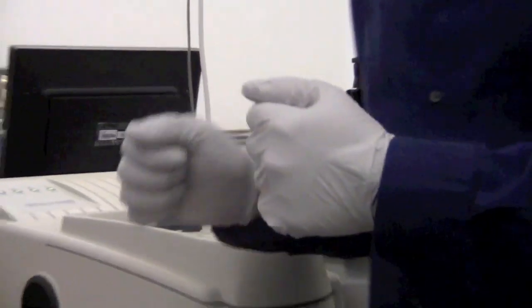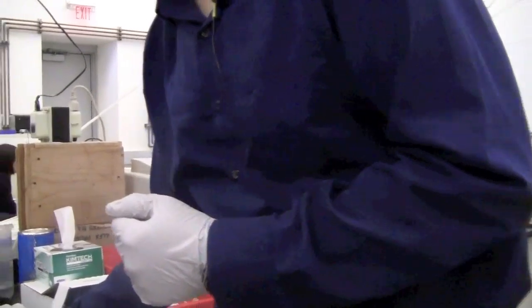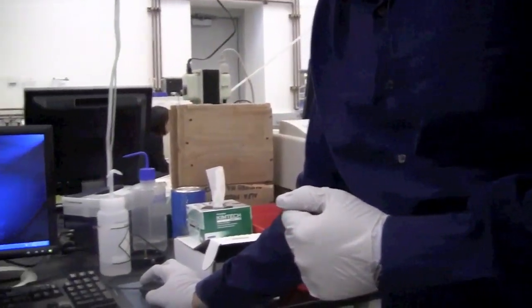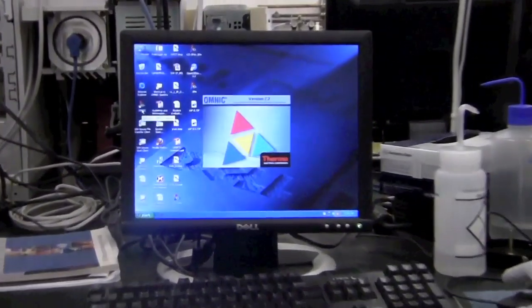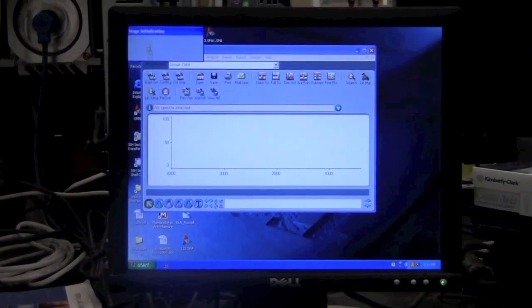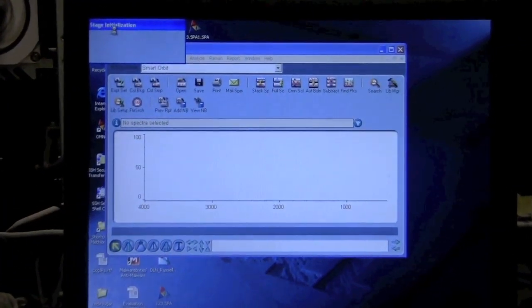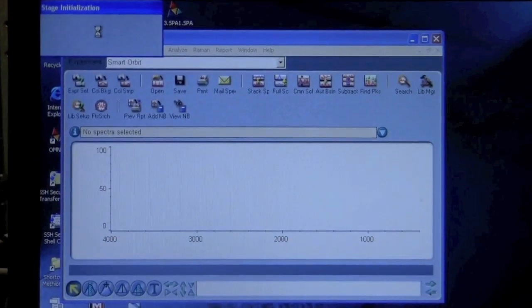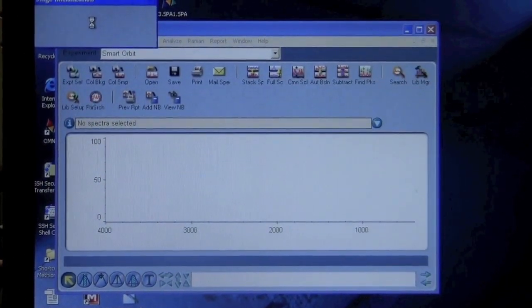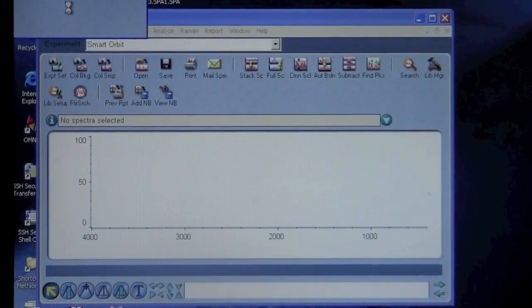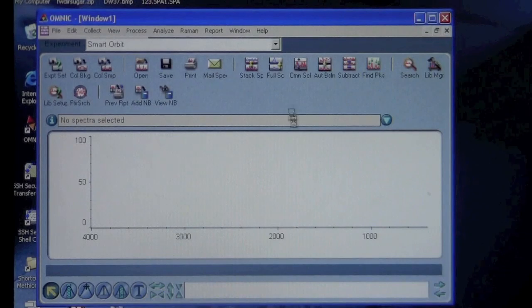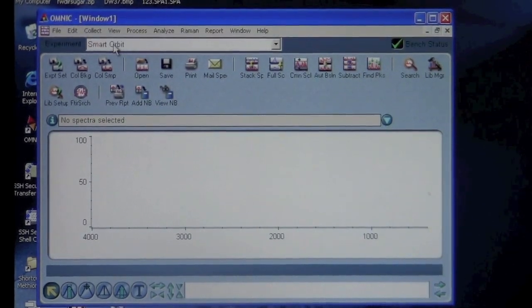Next, you can come over to the software and start the software, which is called OMNIC. You should be able to start it by double-clicking on the OMNIC icon. It'll bring up a screen saying stage initialization, meaning it's trying to recognize which accessory is loaded into the instrument. It should recognize that the Smart Orbit is loaded and show this screen with Smart Orbit here.